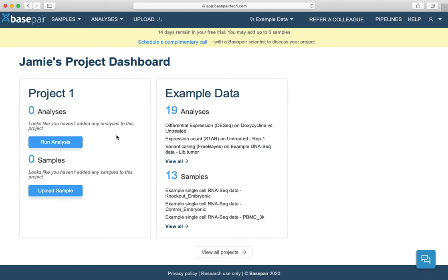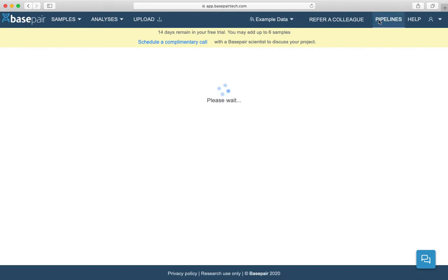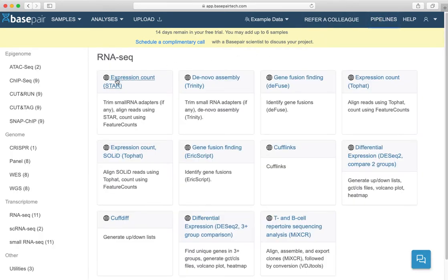If you'd like to see a more detailed overview of the analysis pipelines we have, click the pipelines tab. Here you'll find the pipelines grouped by data type. Click on any individual pipeline to see the steps in that pipeline.